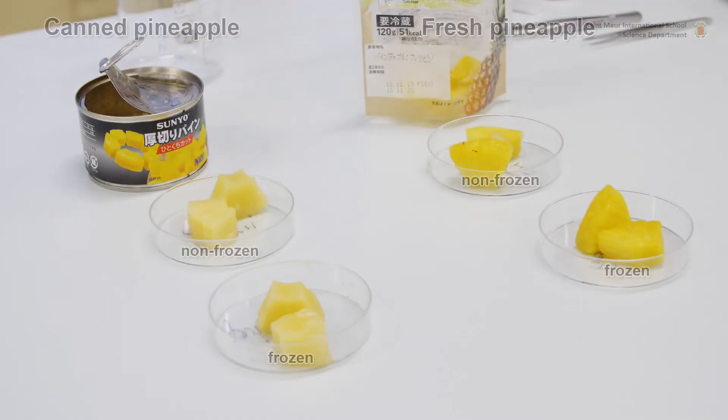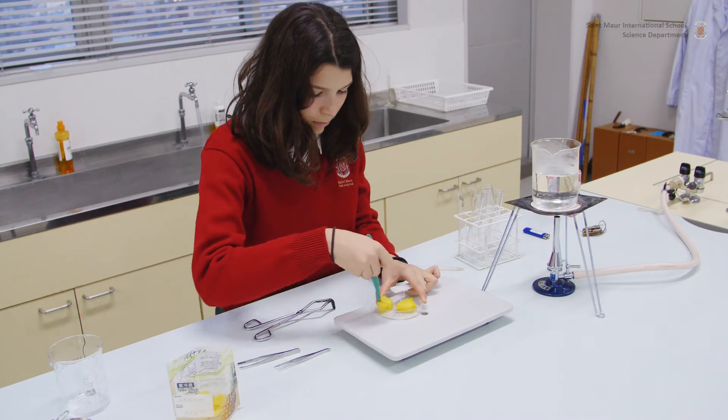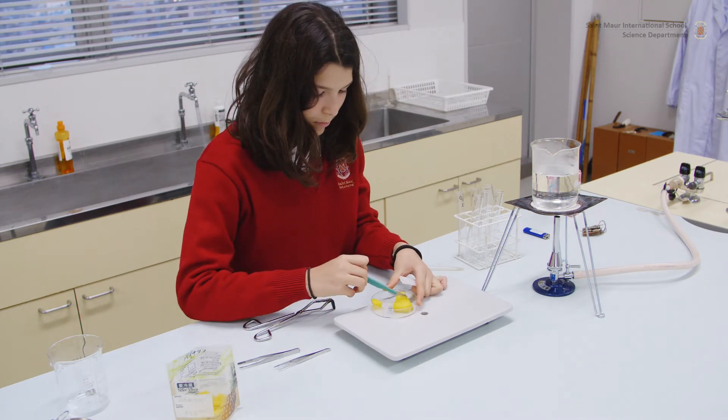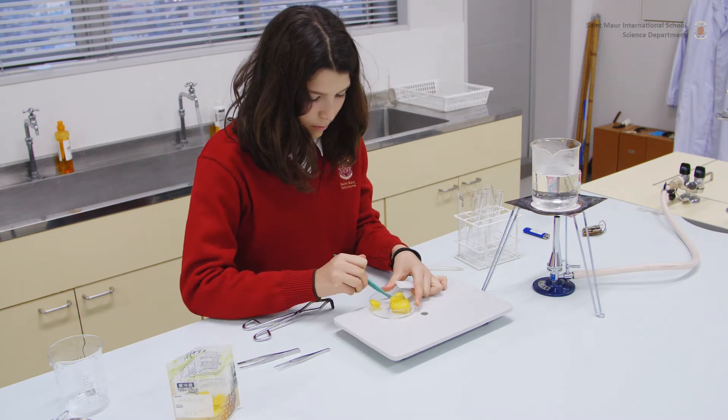Collect the fresh and canned pineapple samples from the fridge and the freezer, and place them into clearly-labeled Petri dishes. Cut each sample into 5-millimeter cubes with a scalpel. Rinse the scalpel between each sample to avoid cross-contamination.